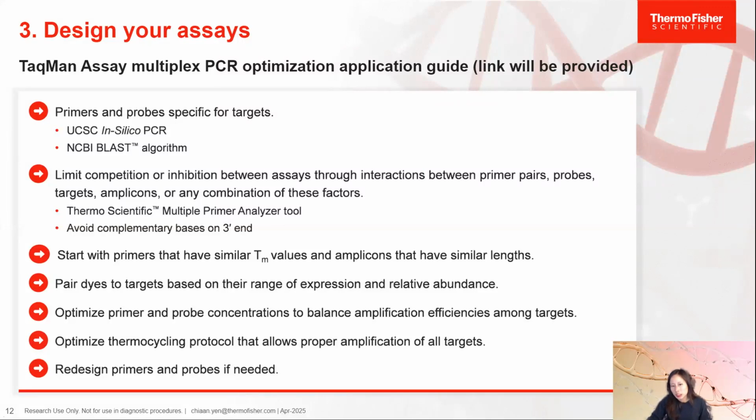And ultimately, you are using one thermocycling protocol for the reaction. So definitely you can play around with that if needed, because sometimes you might have a target that's harder to amplify and requires some adjustment. But just know that once you adjust it, you might fix one target, but your other targets might start behaving differently. So you have to have an open mind going into this, and then adjust as needed.